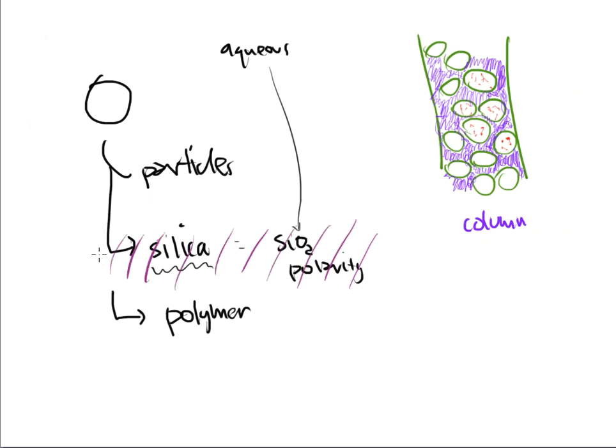Yeah, it's a great idea. It's a great concept. It worked at one point in time. But now, in today's laboratory, silica is not the way to go anymore. It's a polymer-based particle is what I would want to be using at this point.